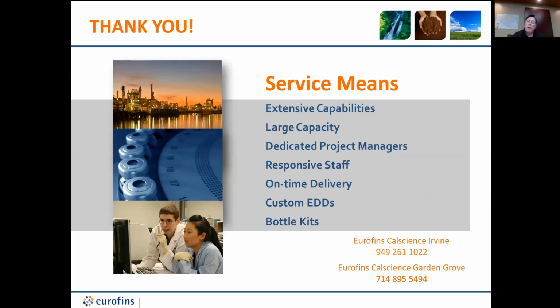We have not seen that here at this point. It rained back in like February, and that's really kind of the last of what we saw. But nobody's approached me to say, hey, we want to send you our collection device. Can you do a wipe sample on it? So, yeah, I mean, okay. You could maybe collect an equipment blank in the field using that container. Right.